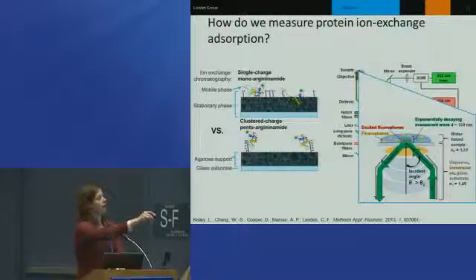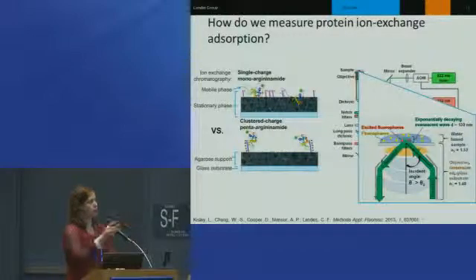And so then our thin film sample goes on top here, and then we flow over our mobile phase, and with our microscope, with this total internal reflection geometry, we only see about the 100 nanometers right where the stationary phase and the mobile phase come together.